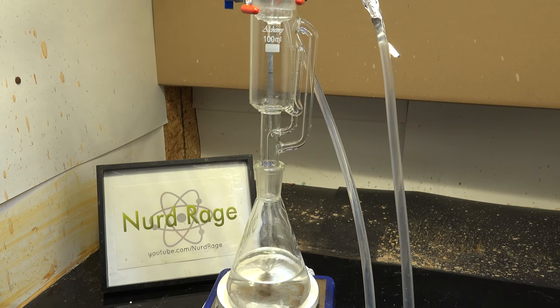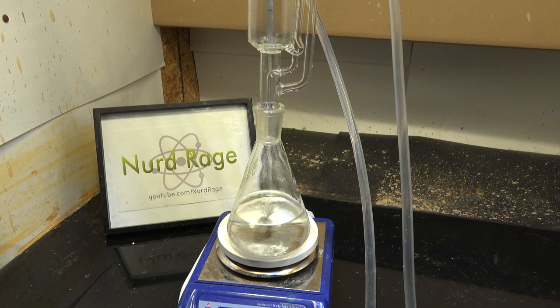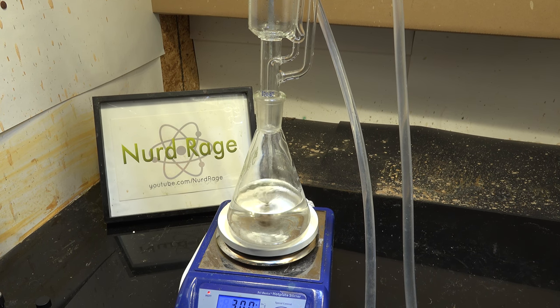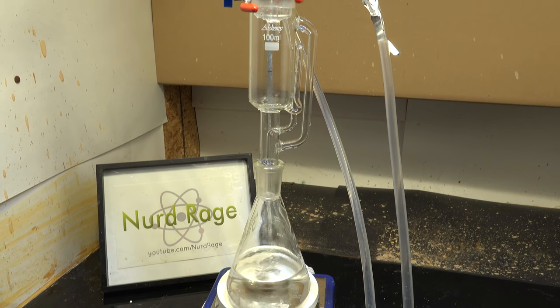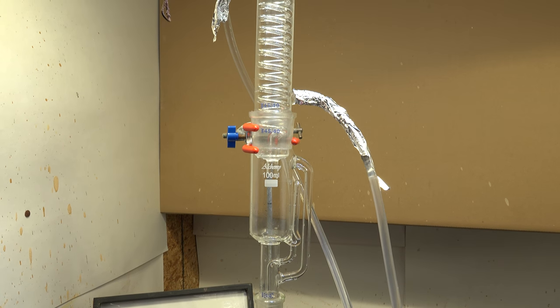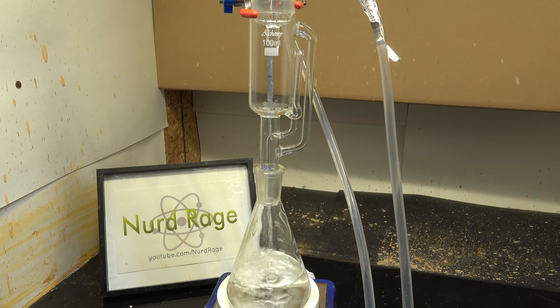So here is the Soxhlet extractor setup. Down here is the boiling flask containing our solvent, and this is where all of these soluble chemicals will end up as the extraction progresses. On top we have the Soxhlet extractor. Mine is empty, but you will fill it with chemicals. On top of that we have the condenser. Now all we do is turn on the heating and let it boil.